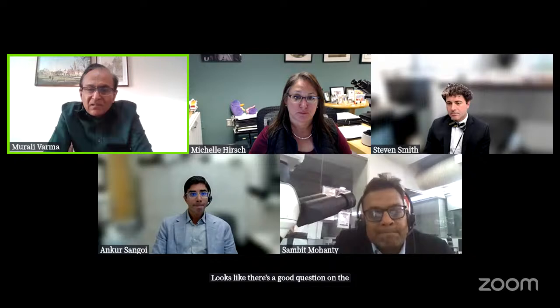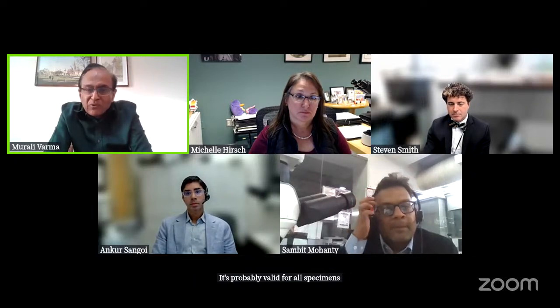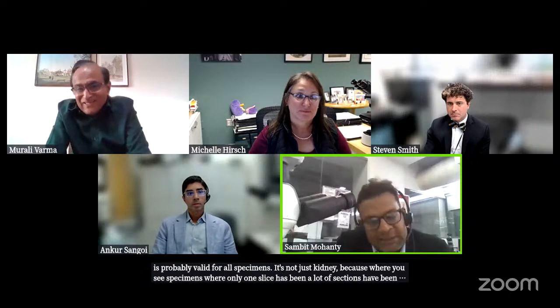Looks like there's a good question on the Gerota's. It's probably valid for all specimens, not just kidney, because you see specimens where only one slice has been taken. A lot of sections have been taken, but just from one single slice. It is applicable to any organ, actually.